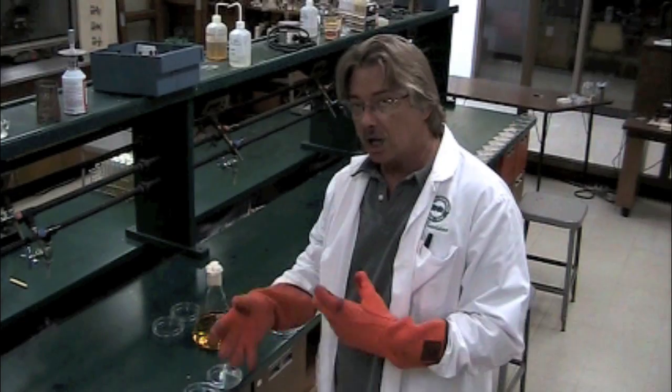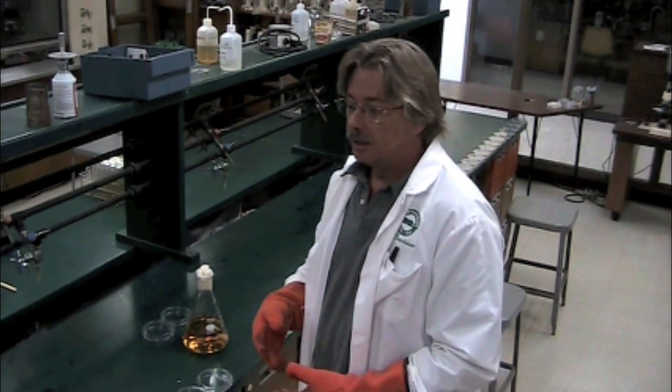We've talked about broth media, and I've shown you how we make slants and deeps. Another very common way that we transfer and grow organisms is by the petri dish or the agar plate.